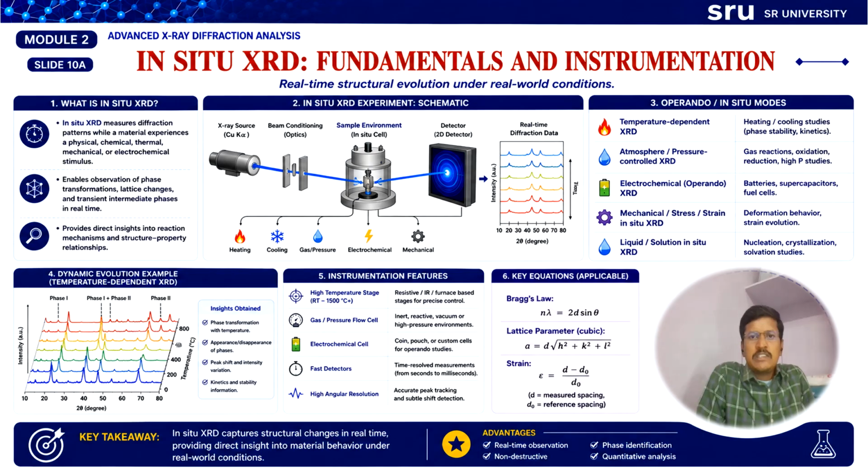By analyzing these changes, the researchers can determine reaction kinetics, thermal stability, and structural evolution of the materials.